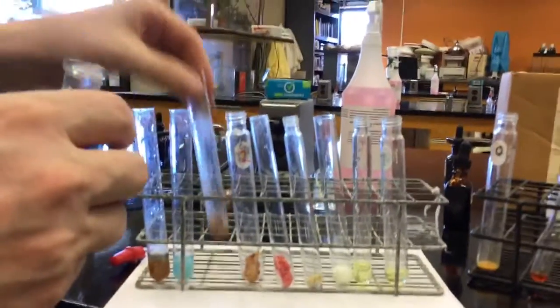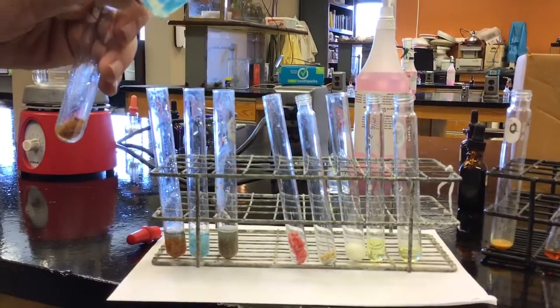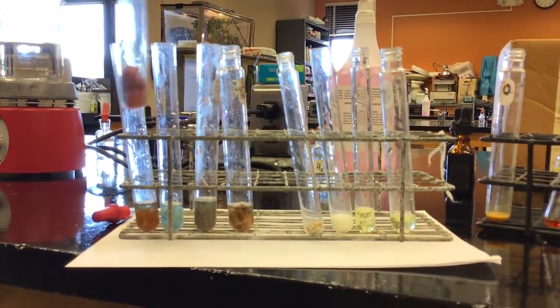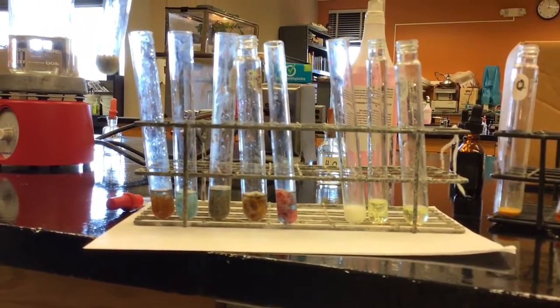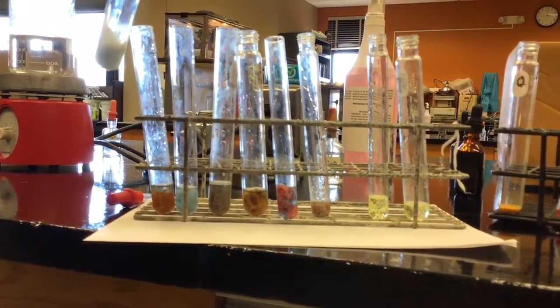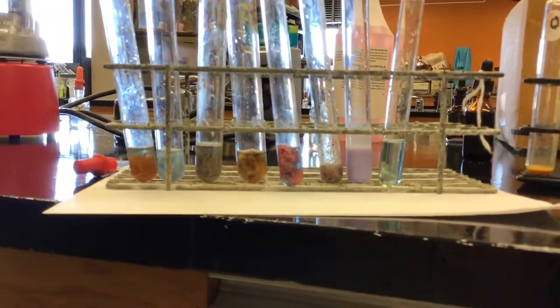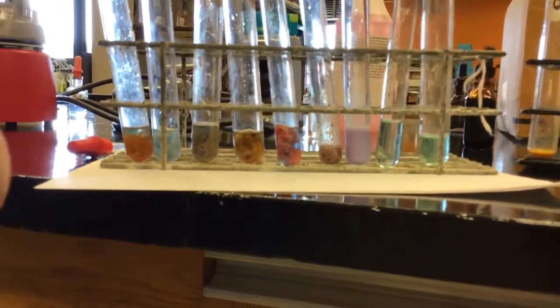Pour and mix. Remember, we don't need a color control because we didn't start with any purple foods. Purple is the positive for Biuret.